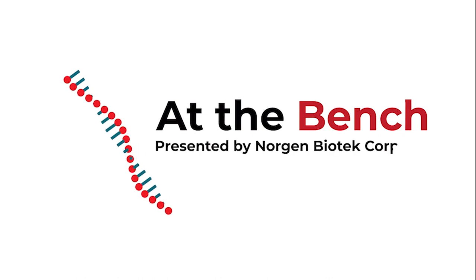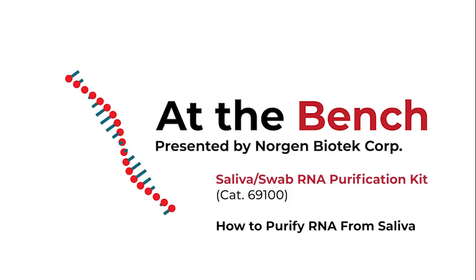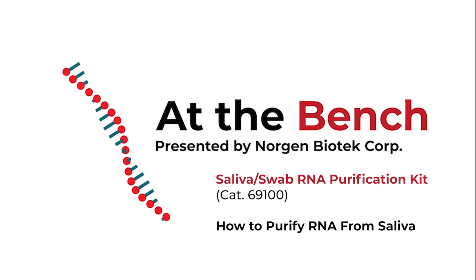Hi! You're watching At The Bench with Norgen Biotech. Today, we will be demonstrating the step-by-step workflow for the Saliva Swab RNA Purification Kit, catalog number 69100.